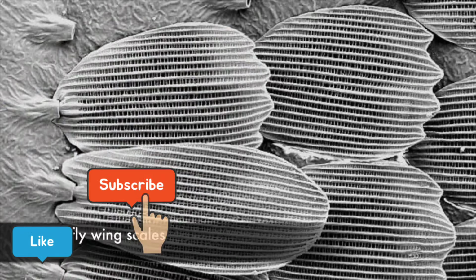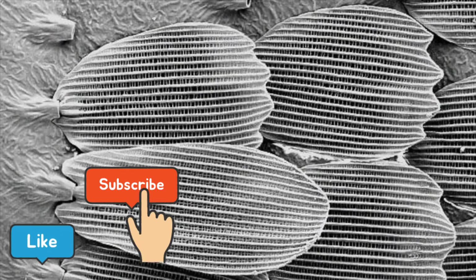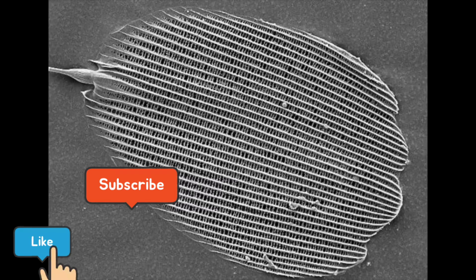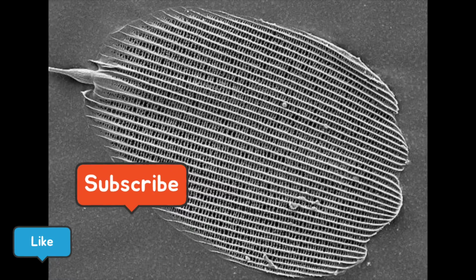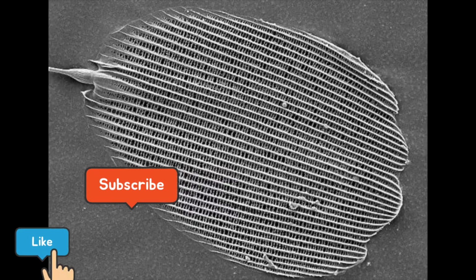Wing scales from the orange part of the wing of a Cleopatra butterfly. Some scales are shield-shaped, others can be shaped like hearts, spears, or very long thin hairs, depending on their location and function. Under high magnification, it can be seen that the scales are constructed from about 20 to 40 parallel ribs, each linked by a series of tiny crossbars. The spaces between the ribs and crossbars diffract light to different degrees and thereby produce the myriad of hues which form the wing patterns.